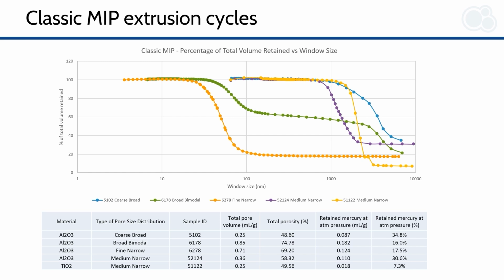Is there some way that we can better characterize these materials using mercury intrusion analysis to gain some perspective into the volume of pore cavities being filled as a function of pore window size and separate that from the volume of pore throats filled, with the throats having the size of the window through which the cavities are filled?